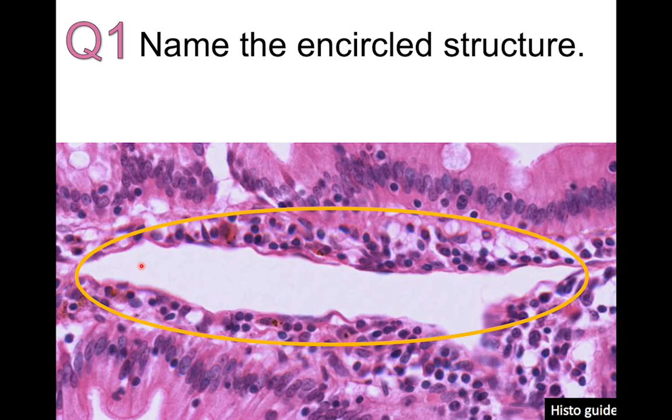In addition, in arteries and veins, it's not a must, but commonly we can see red blood cells in the lumen. But this vessel lacks red blood cells. The lumen is very large, and the wall consists of an endothelium. So this is a lymphatic vessel.